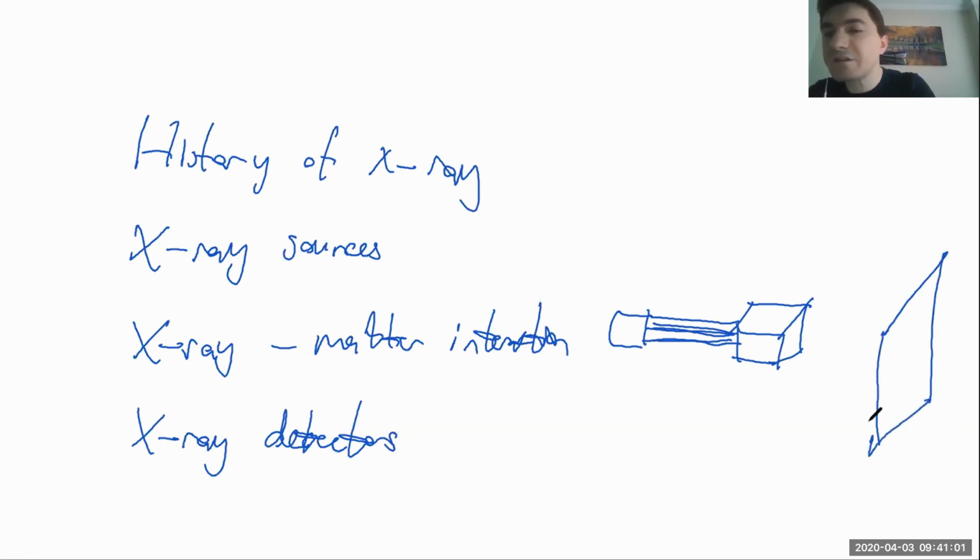We have discussed the details of this type of detectors. They were widely used in the past in order to detect X-rays. Nowadays, they are not used, of course, for scientific purposes, just for medical purposes. So they have observed that there are some spots on the photographic film due to the diffraction from the crystal. Then they provided a proof for the theory of von Laue.